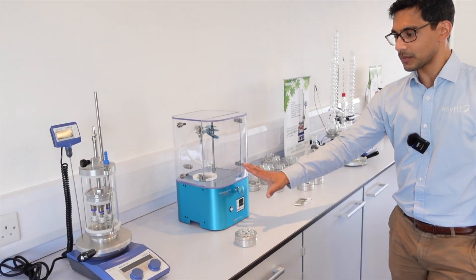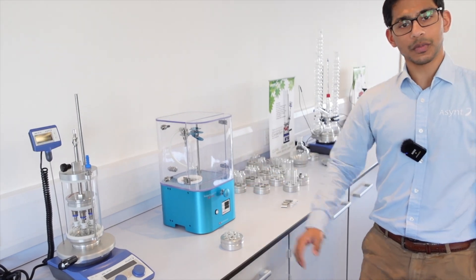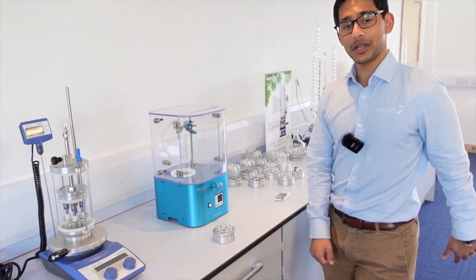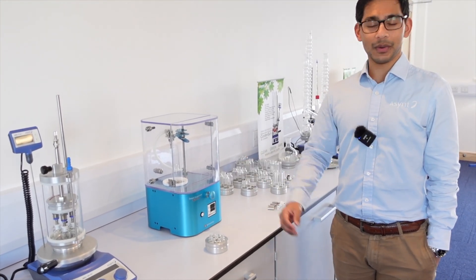But with the Dyson spiral evaporator you must use the same vial size at the same time. With the smart evaporator it's a bit easier and more flexible in terms of vial size, but less throughput. So if you're deciding between the smart evaporator or the spiral evaporator, just drop us a line at enquiries.asin.com and we'll help you out.